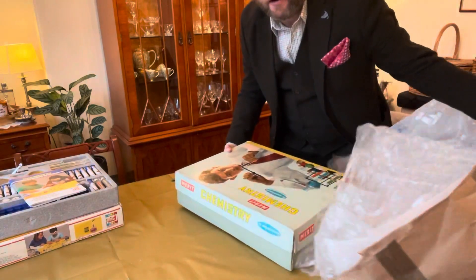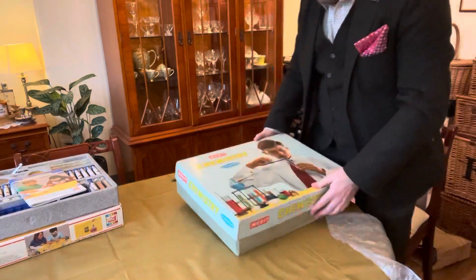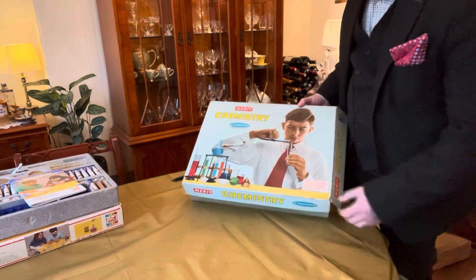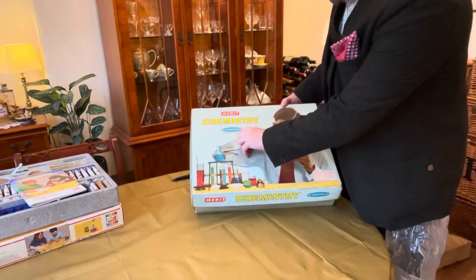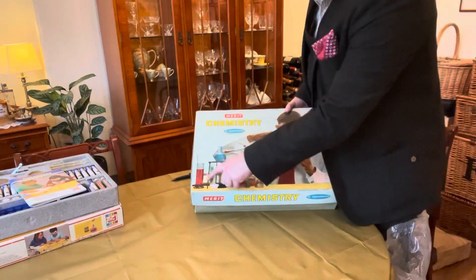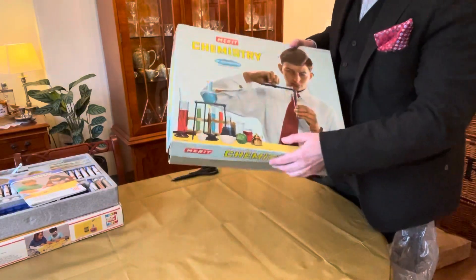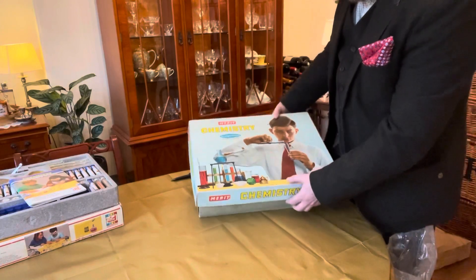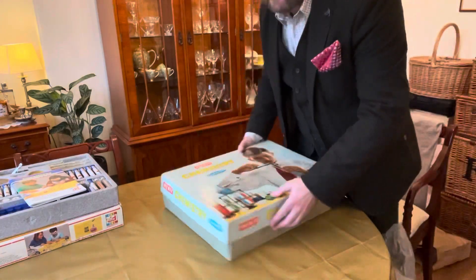Here we go — look at this. This is a Merit chemistry set. 101 experiments. Safety tested, whatever that means. Let's hope you get all of this with it, because if you don't I'll be highly disappointed — especially a brass burner.